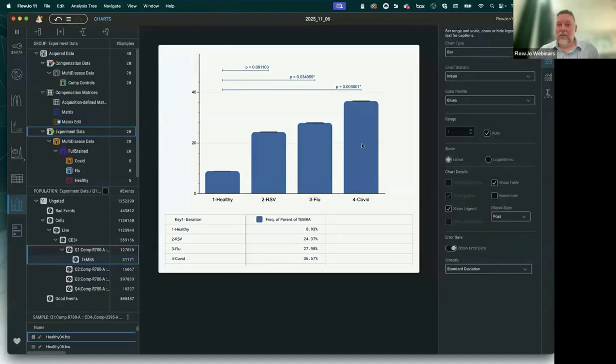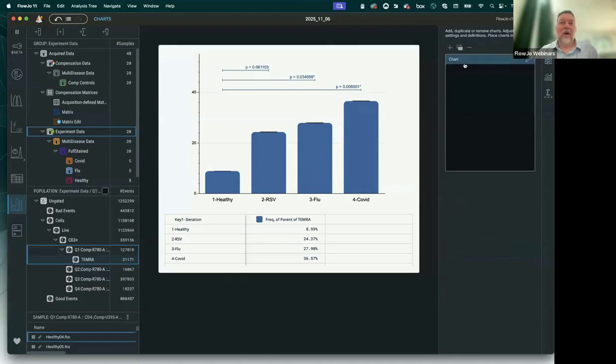You can do more if you don't like the colors, there are different color palettes and stuff, right? And you can duplicate this chart again and modify it once you've created it by this duplicate button, or create as many charts as you want, make them different colors, different styles, and have different comparators. But you can make many of them. Okay.